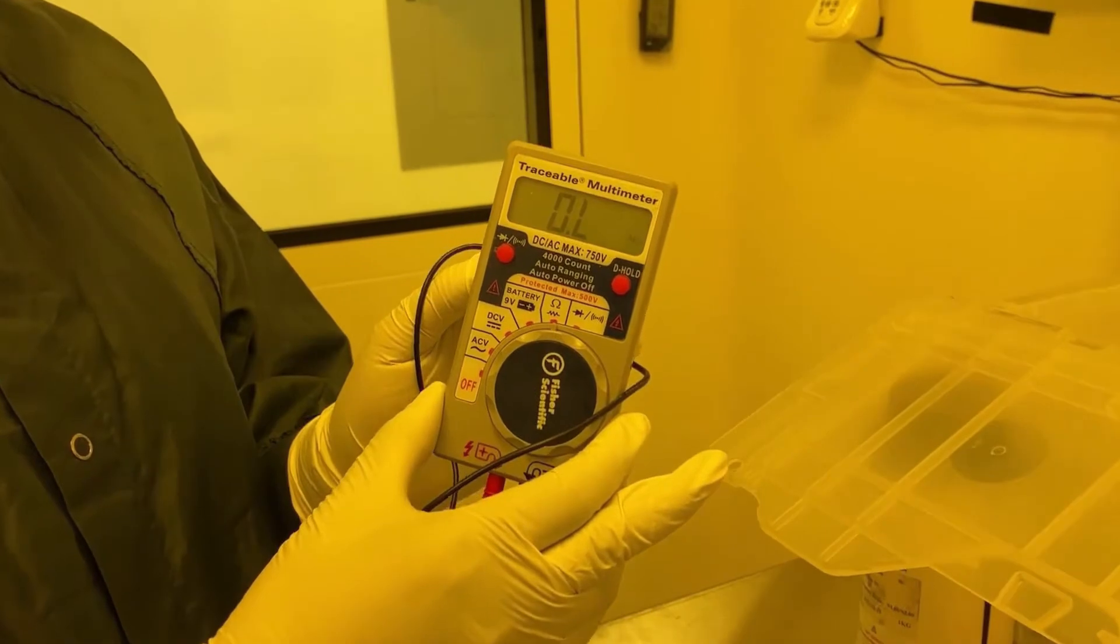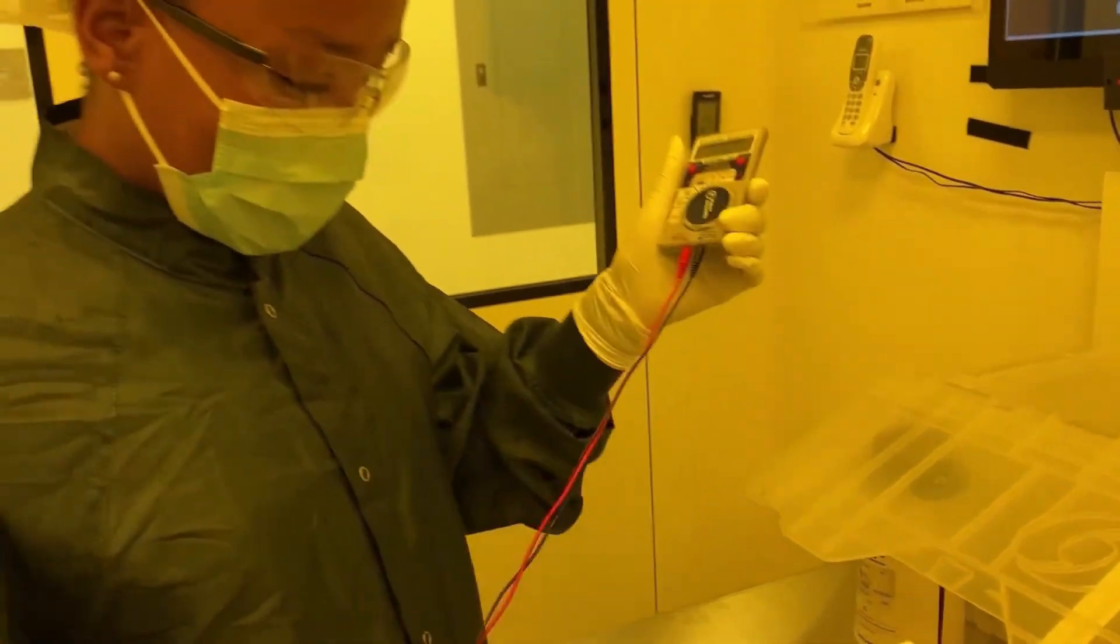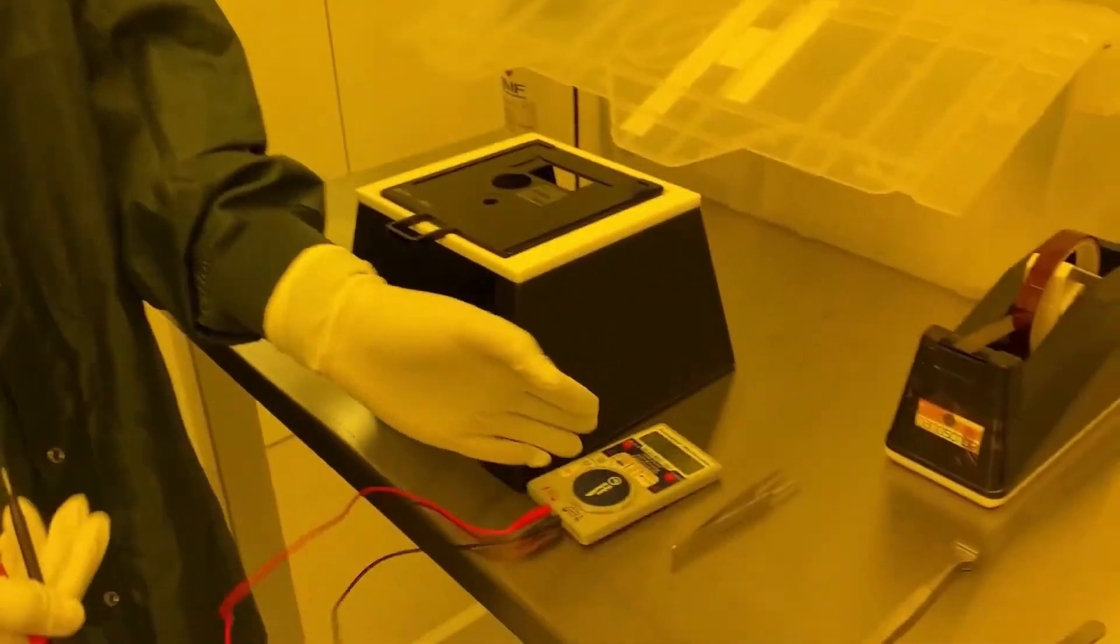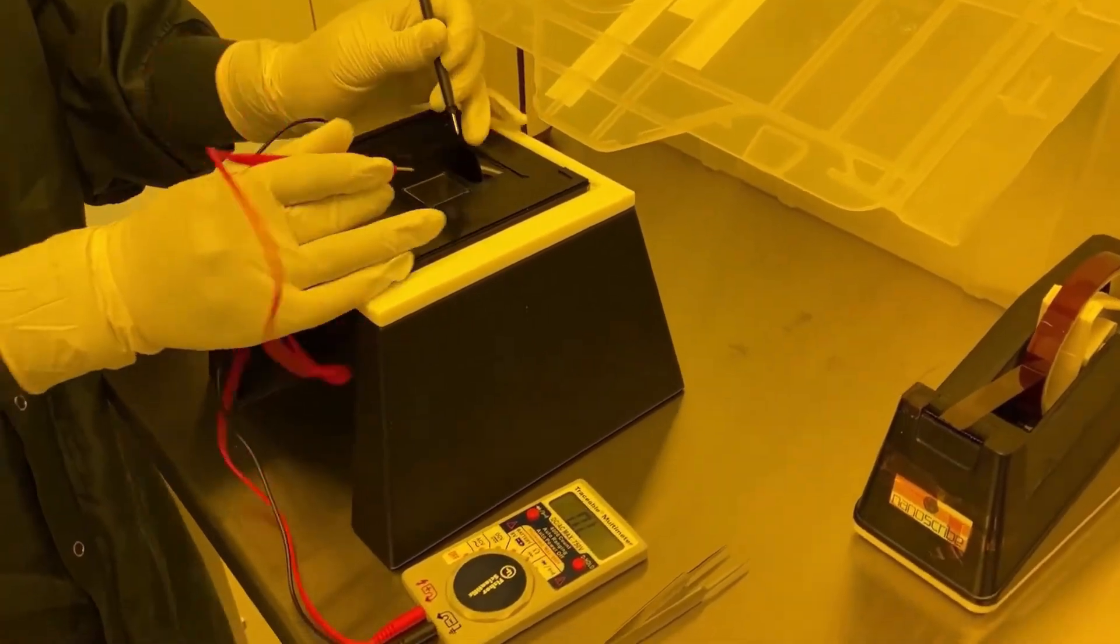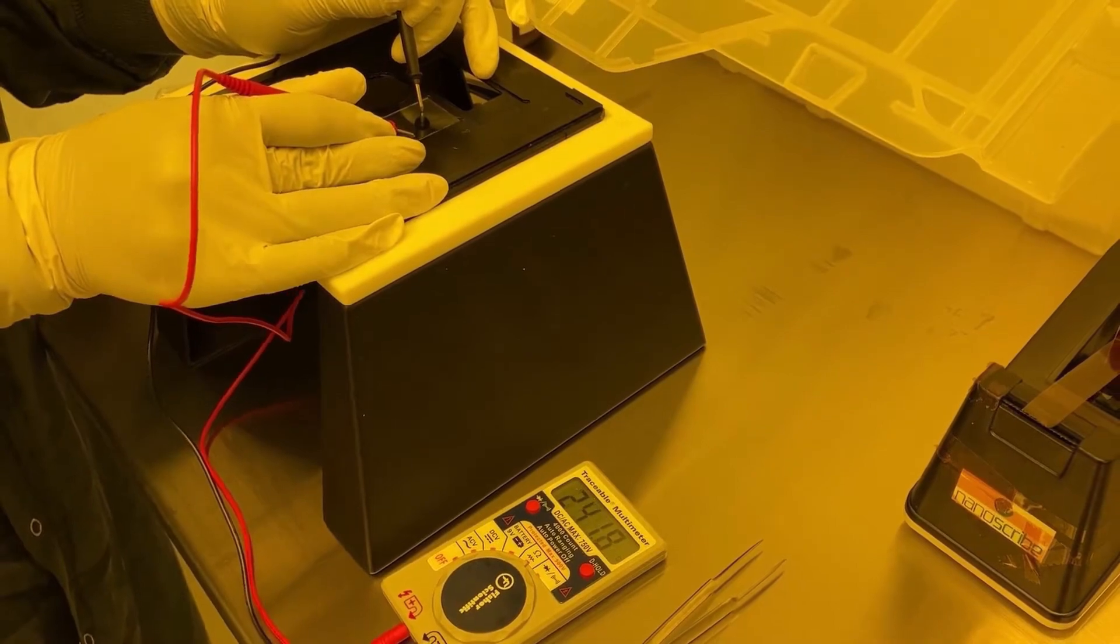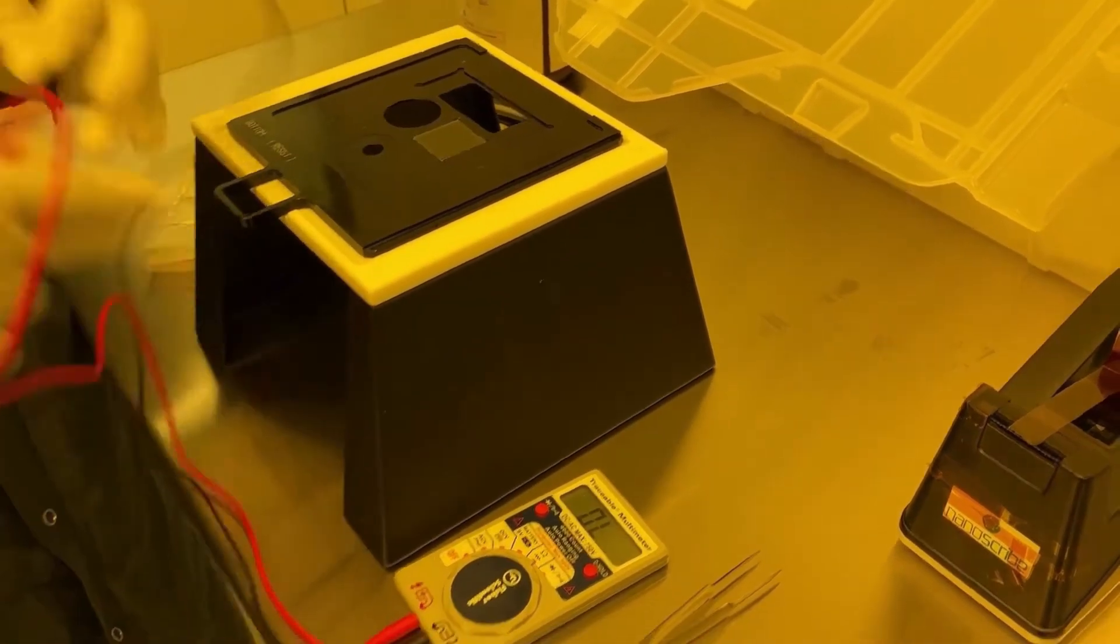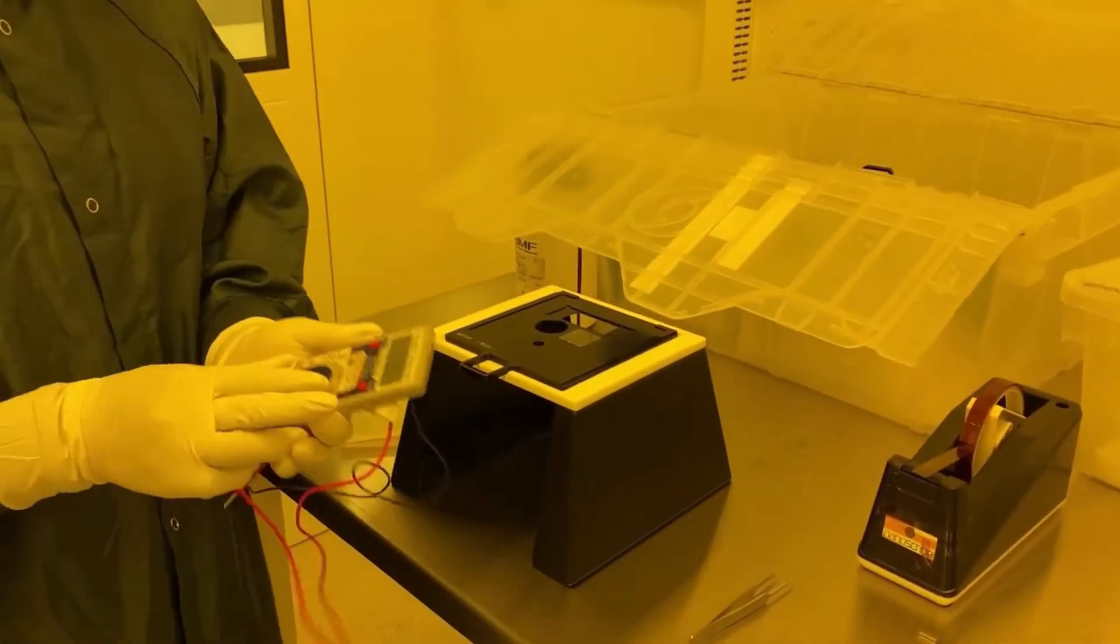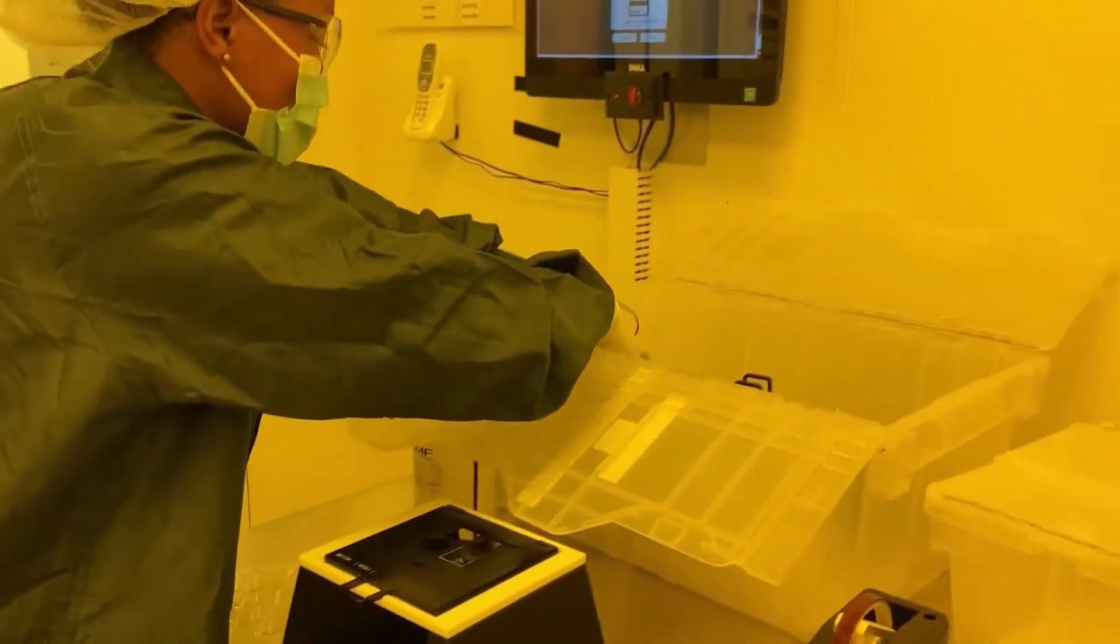Rest the wire leads on the substrate. If the multimeter reads back numbers, you know you are on the correct side because it shows that that side has conductivity and you can continue the process. If there is no reading and the multimeter reads zero, then turn the substrate over to the other side and test again.